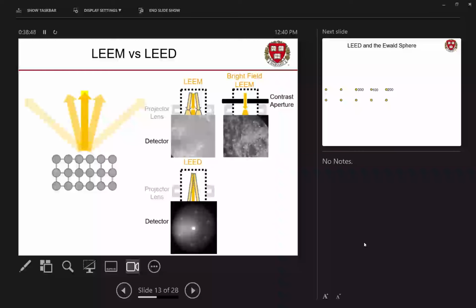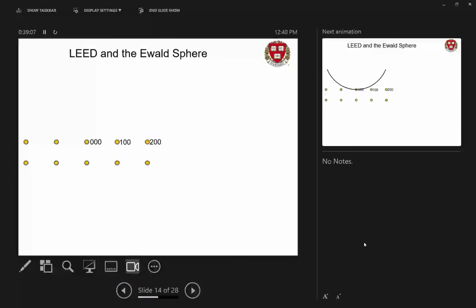And as a reminder, this is the crystal structure of the top atomic monolayer of your sample, not the whole crystal. The insides of crystals are these beautiful places where things are nice and uniform over very long distances. The surfaces of crystals are these terrifying hellscapes where nothing applies anymore and surface energy rules the day and God only knows what's going on, but this is a way to find out, which is fairly cool.